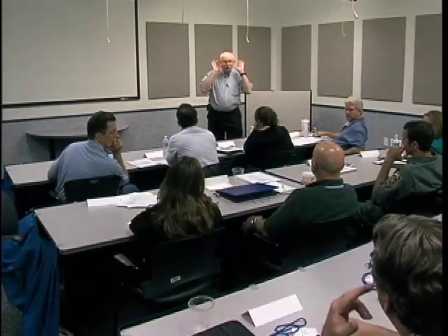High band pass or narrow band pass? I would think... Sorry? On the inherent. Yep. High band pass stacking, right? You ever stack with high band pass? I know we could stack with band pass and narrow. Have you ever tried double high band passing? You mean the same filter twice? Yeah.